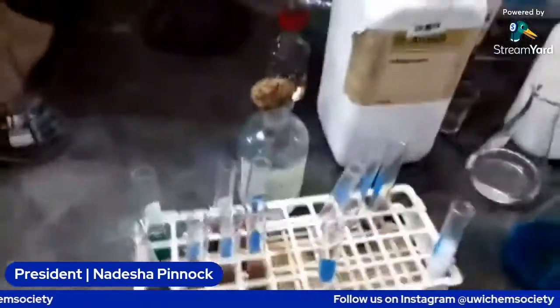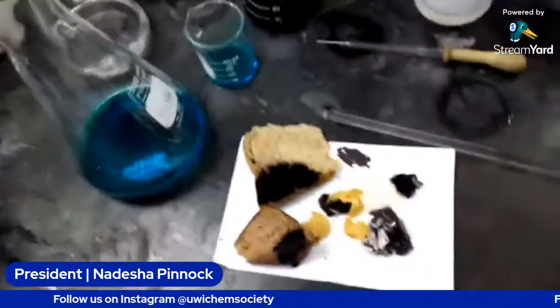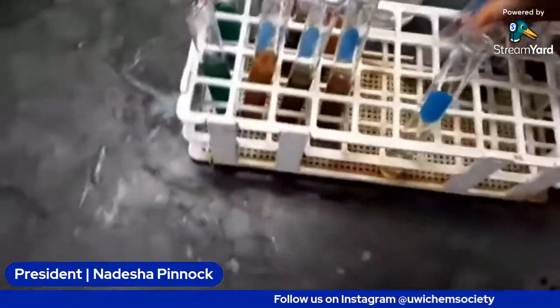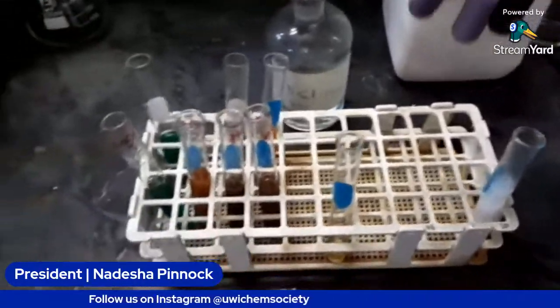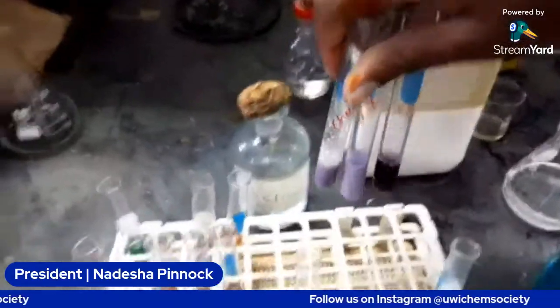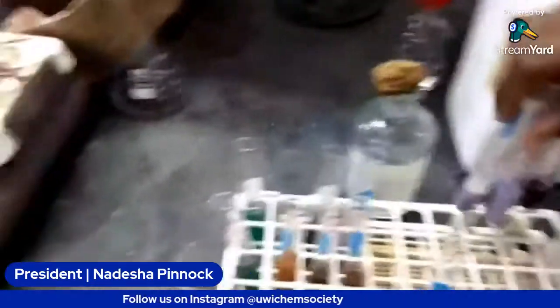All right, guys, so just a recap of what we did today. We did our potassium iodide starch test using Lugol's reagent. We utilized Biuret reagent, which is copper sulfate and sodium hydroxide, to make the Biuret reagent, and carried out the Biuret test for proteins.